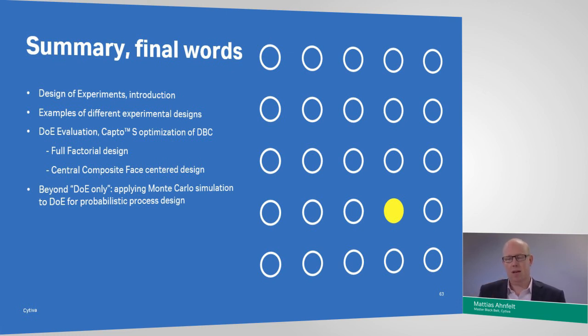So we take a big step by applying the DoE approach, and then by also leveraging Monte Carlo simulation or another probabilistic tool, we can take another step in improving our understanding of how our processes behave and work. And of course, from a process development and scale-up and manufacturing perspective, the question about how variation translates through the process is also highly valuable.